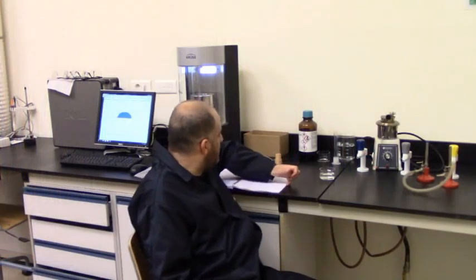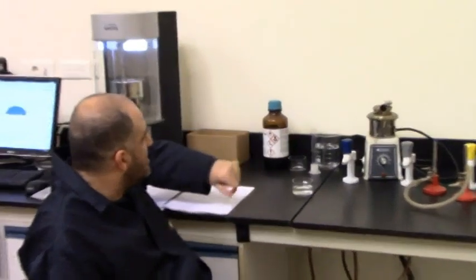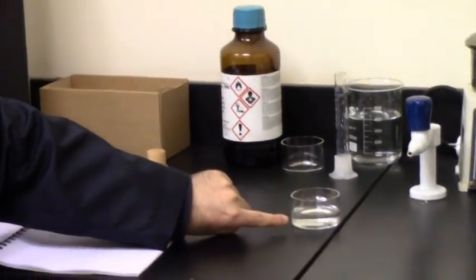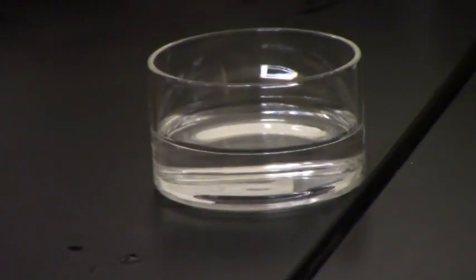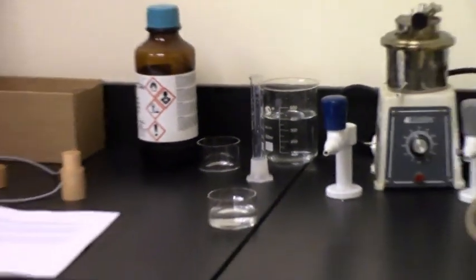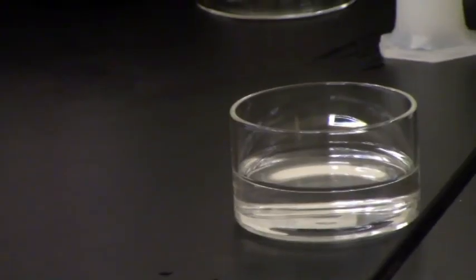Now, I've cleaned these two vessels and the graduated cylinder, and I filled this vessel with about 50 cc of tap water from this beaker using this graduated cylinder. It is good to keep the volume not too much and not too little, and to make it consistent through the experiment to eliminate the effect of the volume of the liquid sample on the measurements.